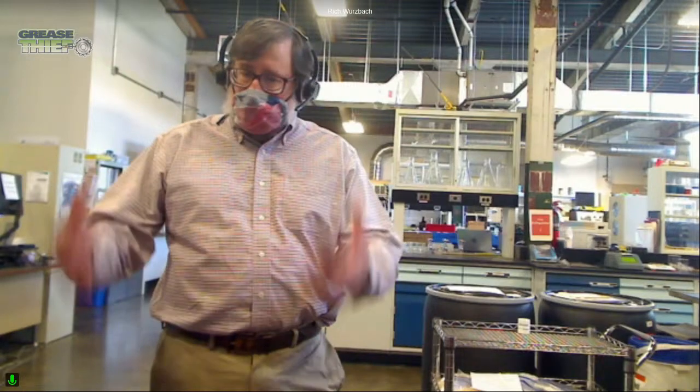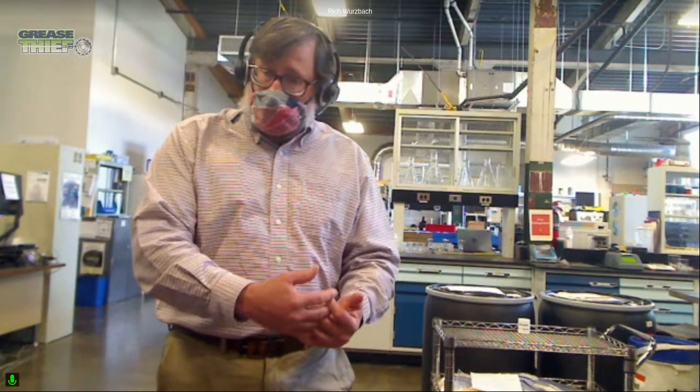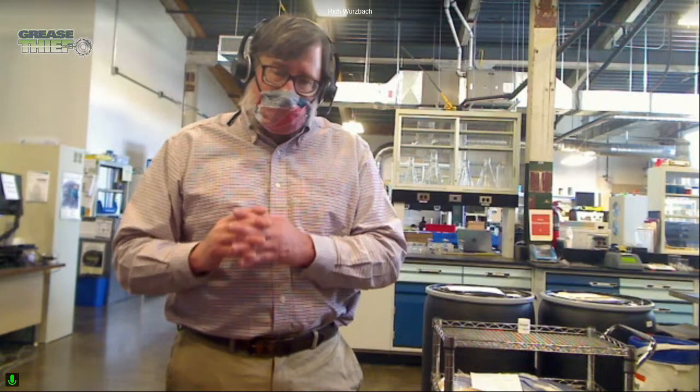And yet the guidance for those assets is, regardless of what's going on, you just change the grease out at the same calendar frequency. And what we found by analyzing them and looking at all these different parameters, including the antioxidants, it was clear that there were differences in the aging profiles of those greases. And so that manufacturer was able to go back and make adjustments to better optimize being specific to the application for that grease and for the equipment and the way in which it was being used.